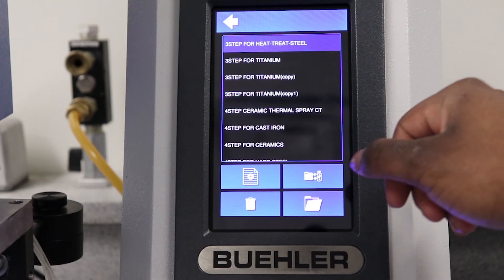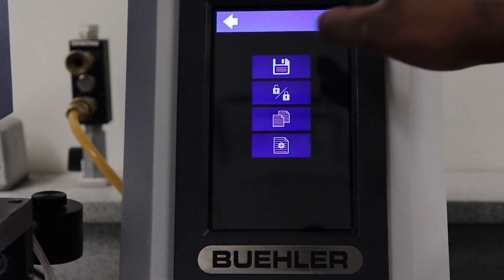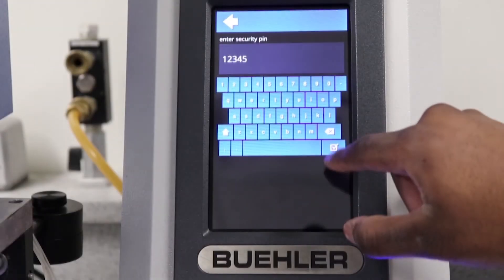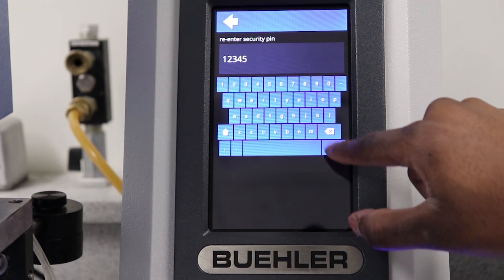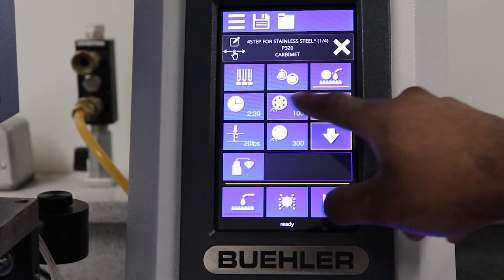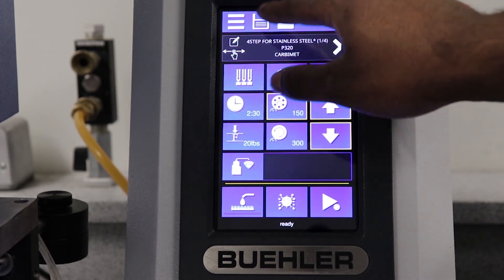Methods can be exported and shared between machines via USB. One can also lock methods with a security pin, which prevents users without a pin from editing and saving over the locked method.